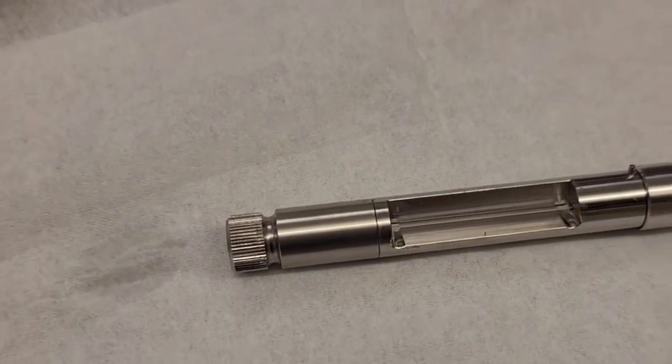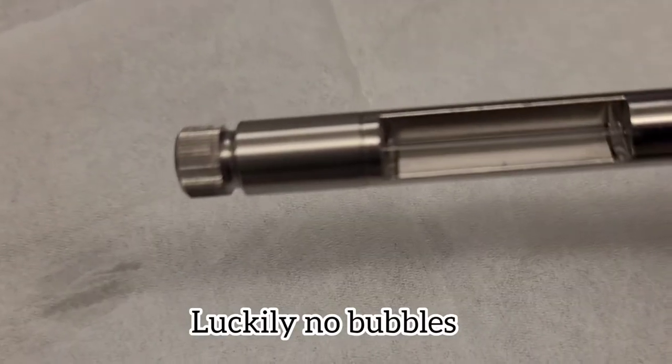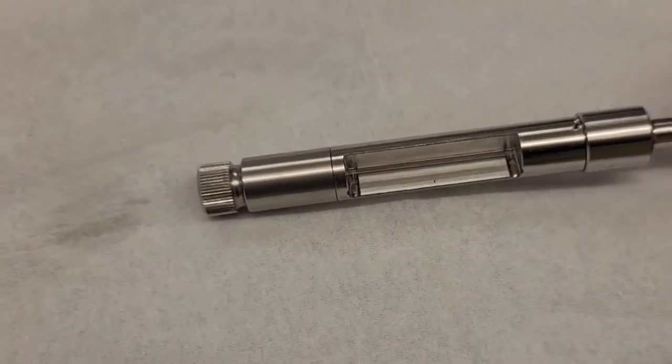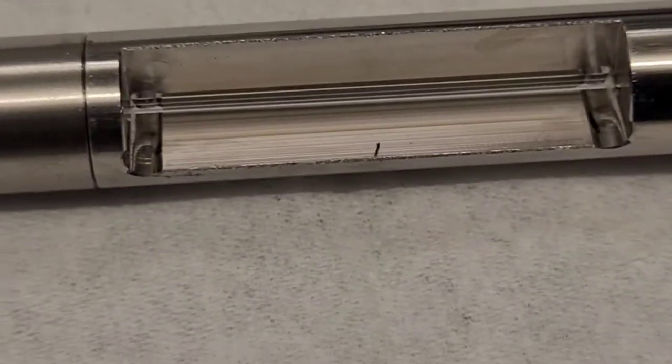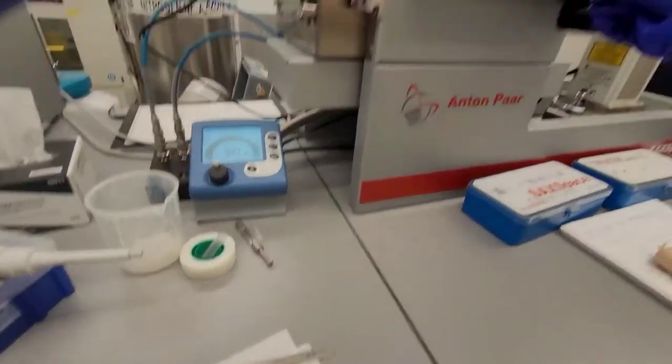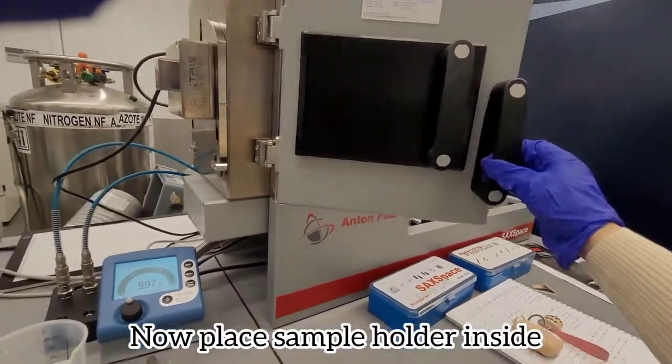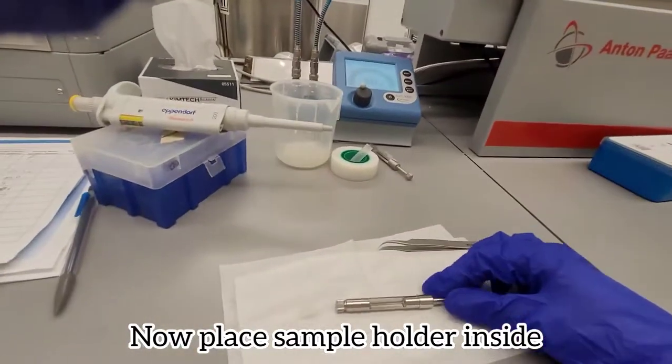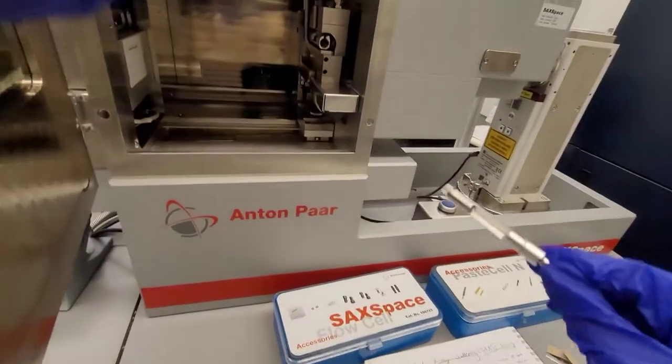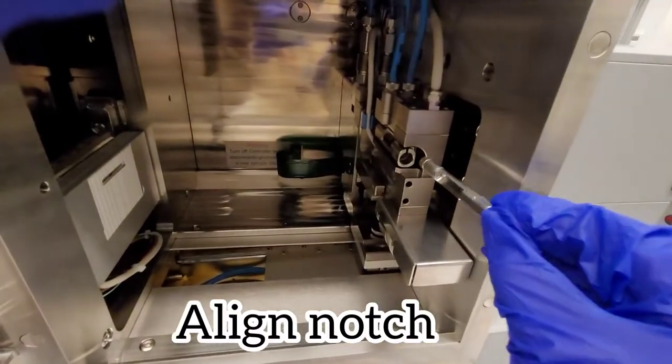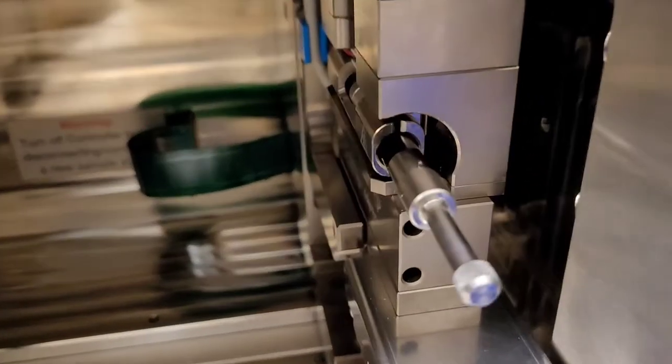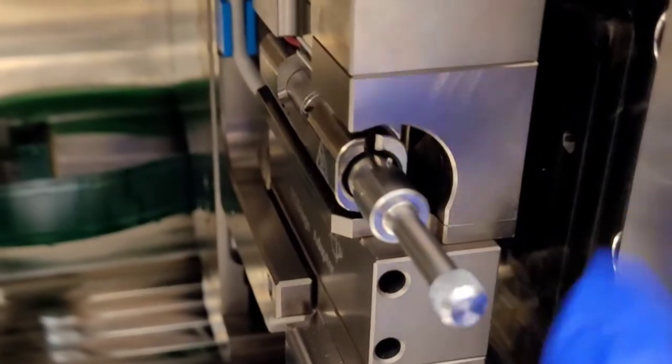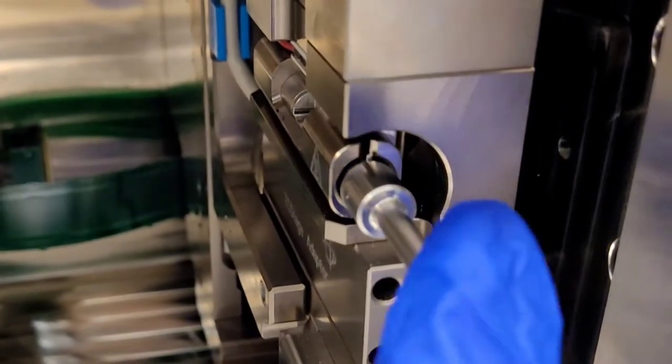This is the hardest part when it comes to loading the sample and make sure there are absolutely no bubbles because that would introduce artifacts into your spectra. Then you put the sample holder in and when you do that you have to make sure the notch aligns. There's only one correct way to do it, and you can see it here.